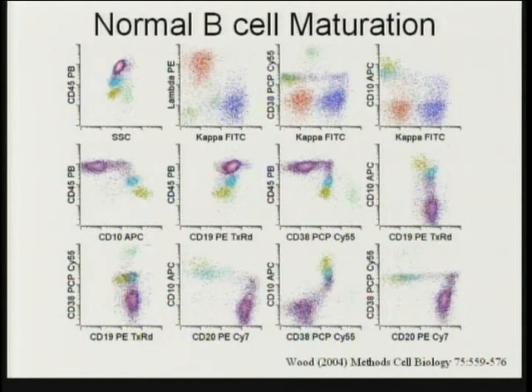And this is an example of B-cell maturation being demonstrated by 8-color flow cytometry, where one is looking just at the CD19 positive B cells and is able to see the very tight correlation of the antigen expression present on many of these populations. For instance, there's a population that expresses out here CD10 at a relatively high level, CD45 at a relatively lower level, and as the population matures, the level of CD10 declines slightly as CD45 increases.